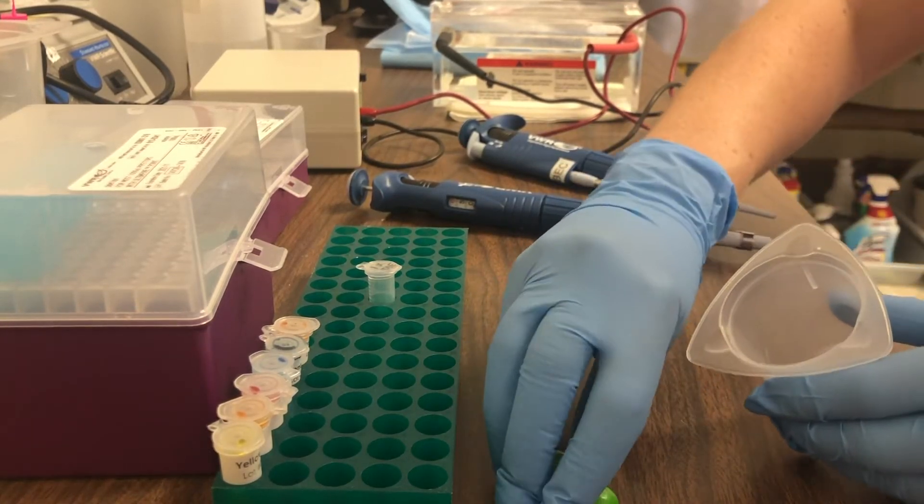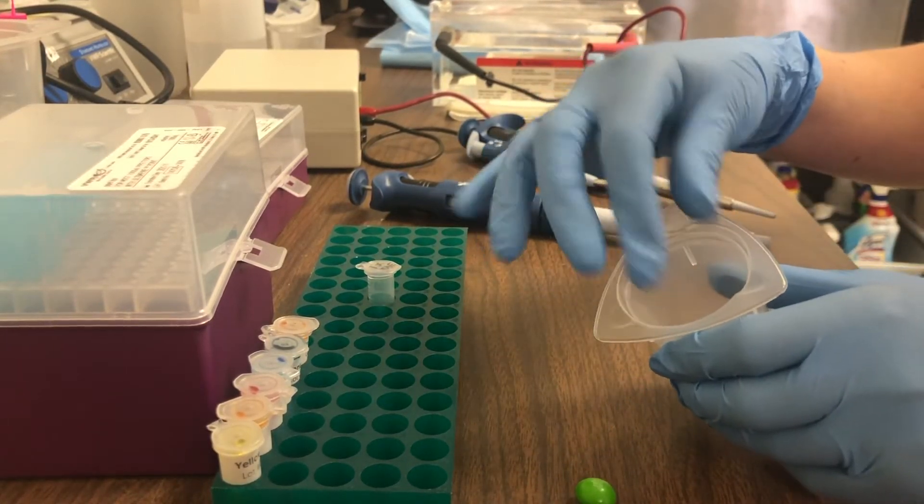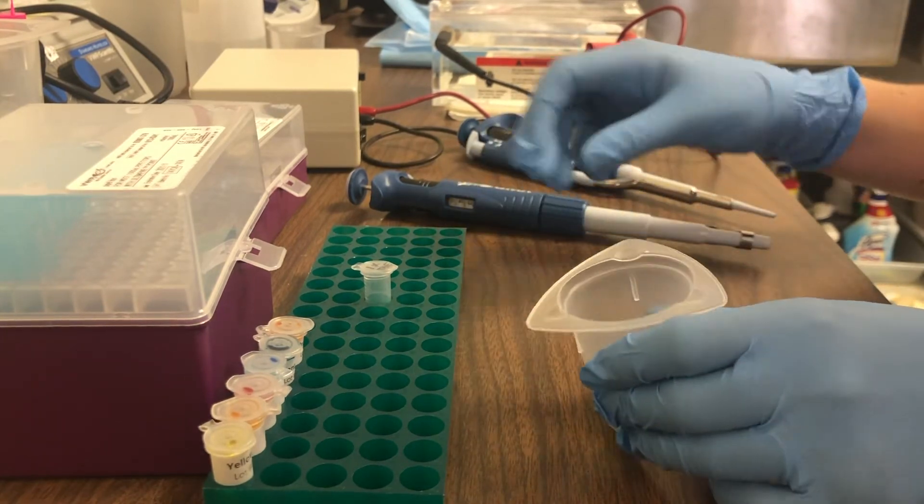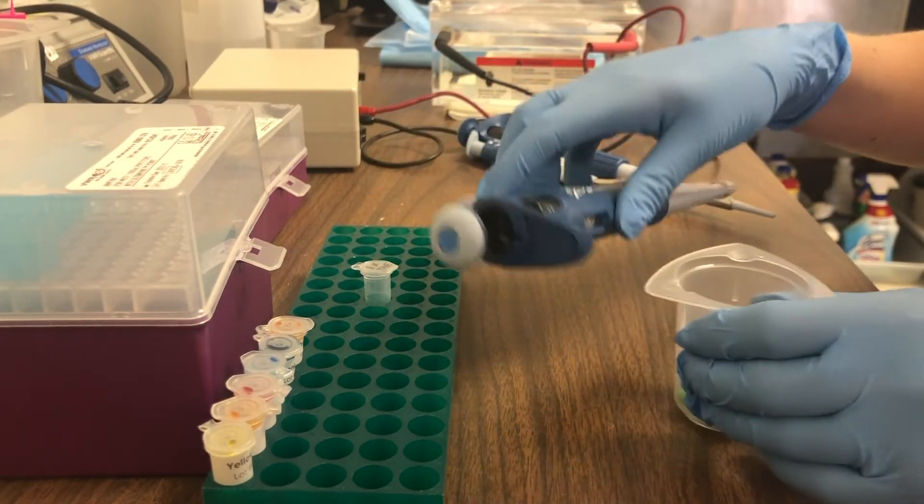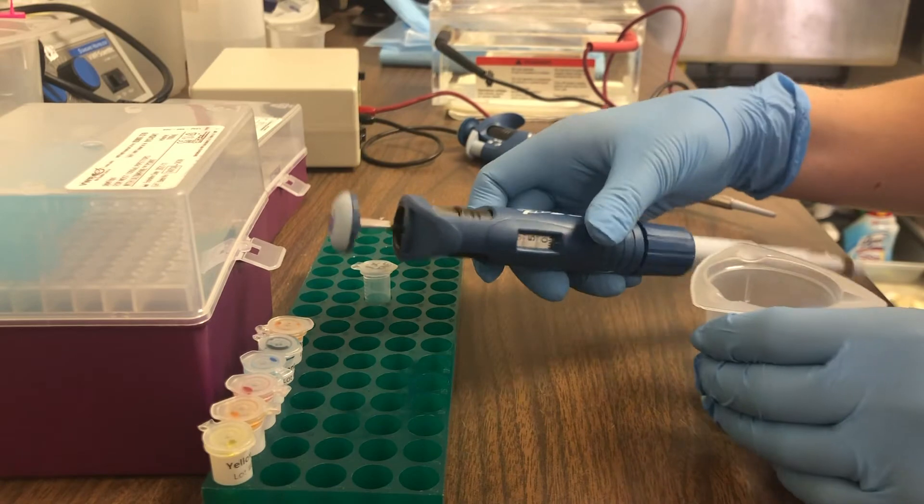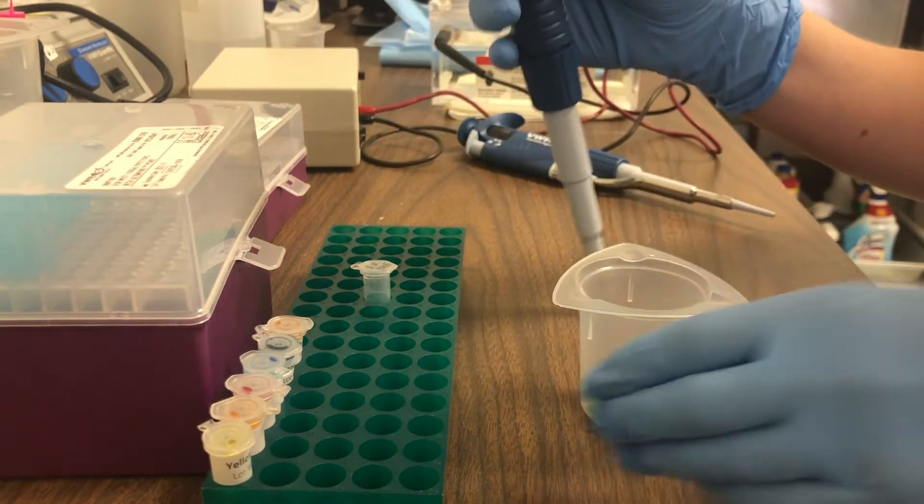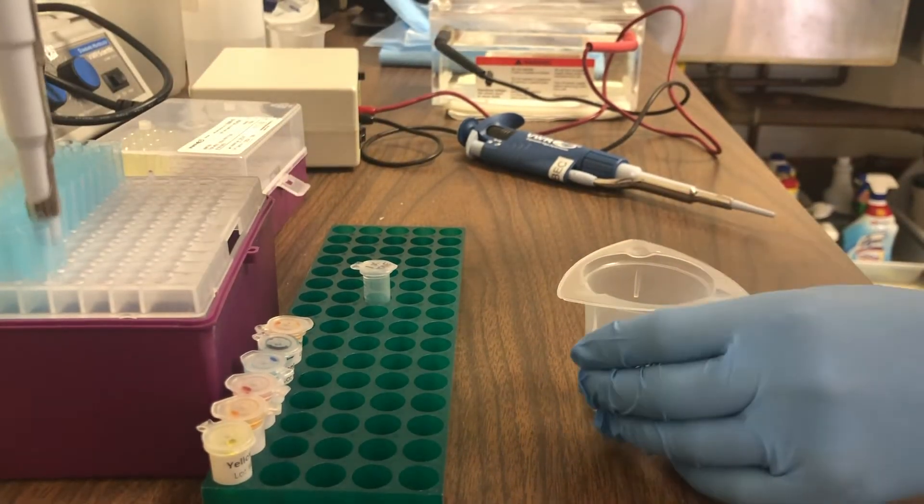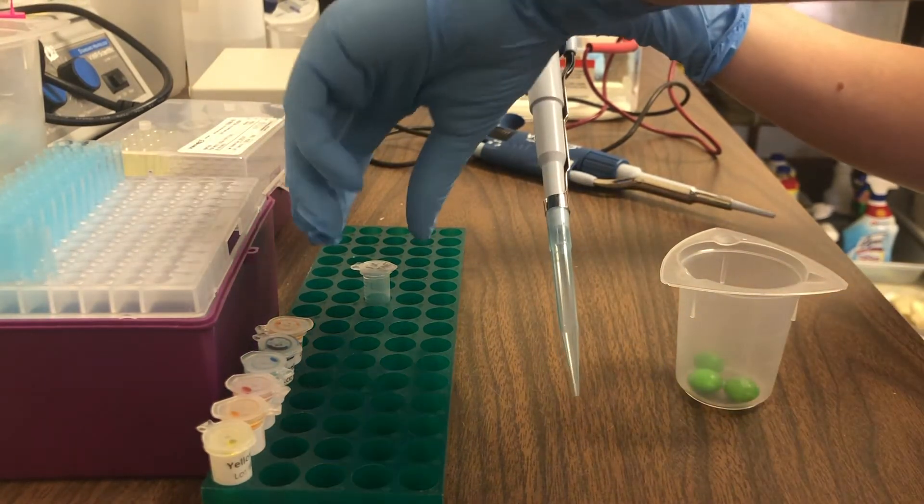Let's begin by adding our Skittles to our plastic beaker here. We'll grab our P1000 micropipette, set the volume to 500 microliters, and make sure we get a tip on our micropipette.